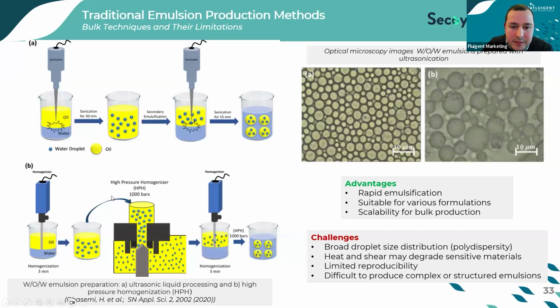So in microfluidics, droplets are generated with precise control over size, frequency, and uniformity, enabling highly reproducible microreactors, in contrast to the traditional batch, which you can see, for example, in the images, either the technique or the microscopic images of the obtained droplets, where it produces heterogeneous droplets with broad size distribution. One of the important parameters that we are talking about today is stable flow rates, which are essential for controlling droplet monodispersity and ensuring reliable experiment outcomes.